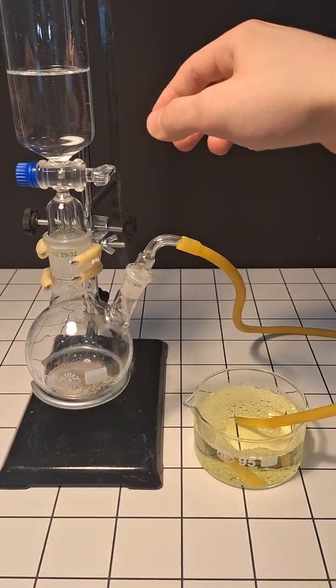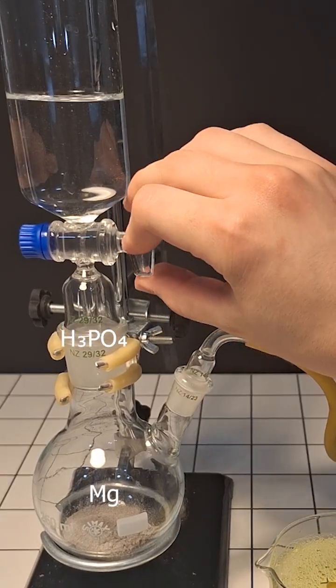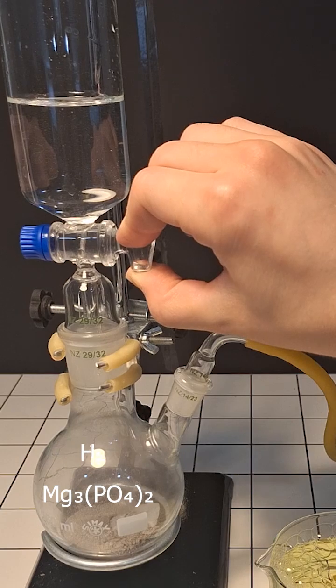At this point everything should be ready and all we have to do is carefully open the valve. What's happening here is that the acid is reacting with the magnesium, forming some magnesium phosphate and hydrogen gas.